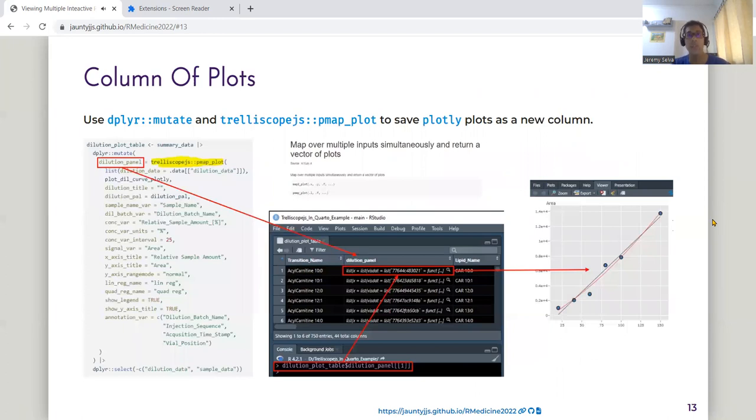This slide shows that it is possible to create a new column full of plotly plots. And this is how it is done. You first use the dplyr mutate to create this new column. And then you use the pmap_plot function from Trelliscope.js to create these plots. And then this is how I usually call the plots. For example, for the first transition, this is how the dilution plot looks like.